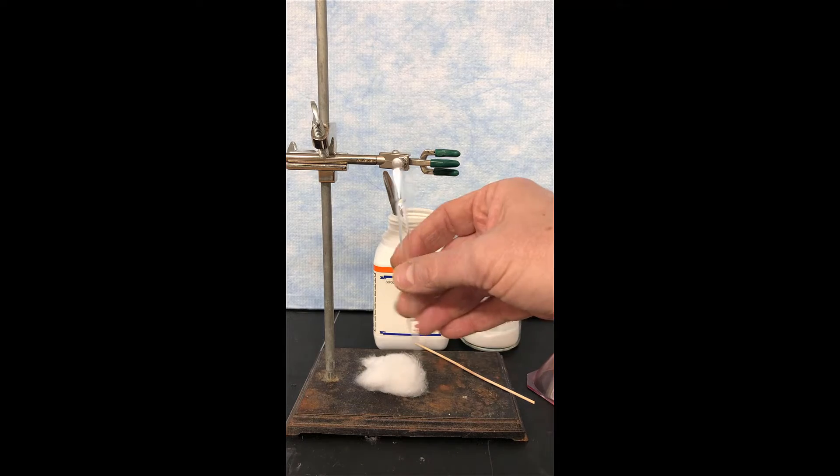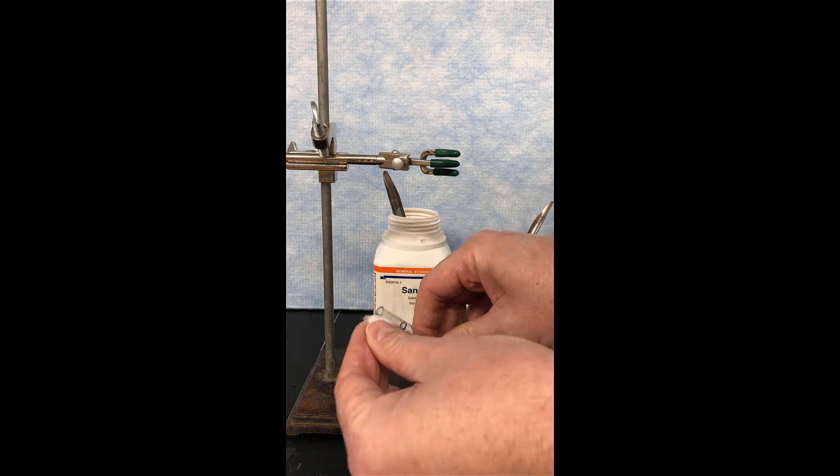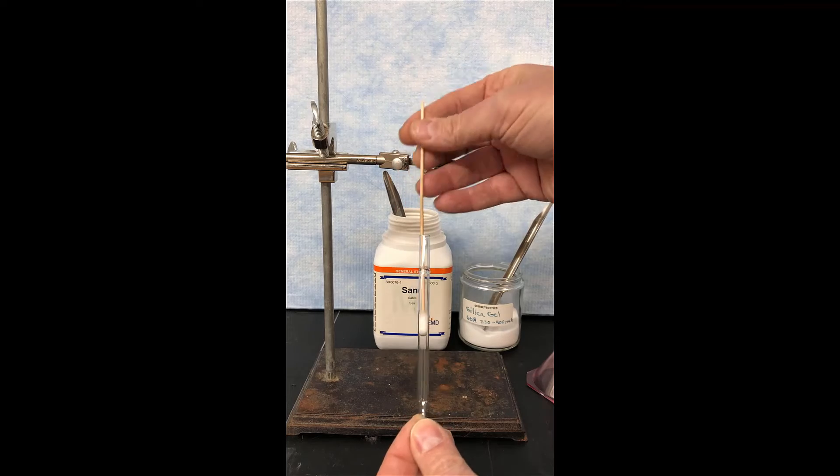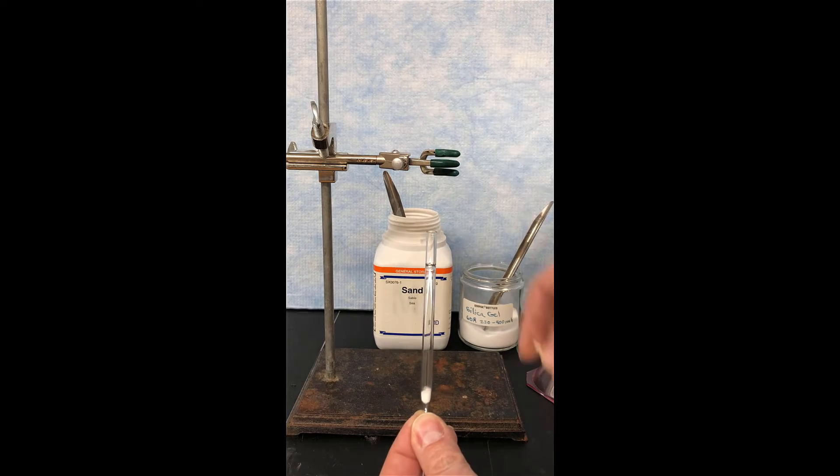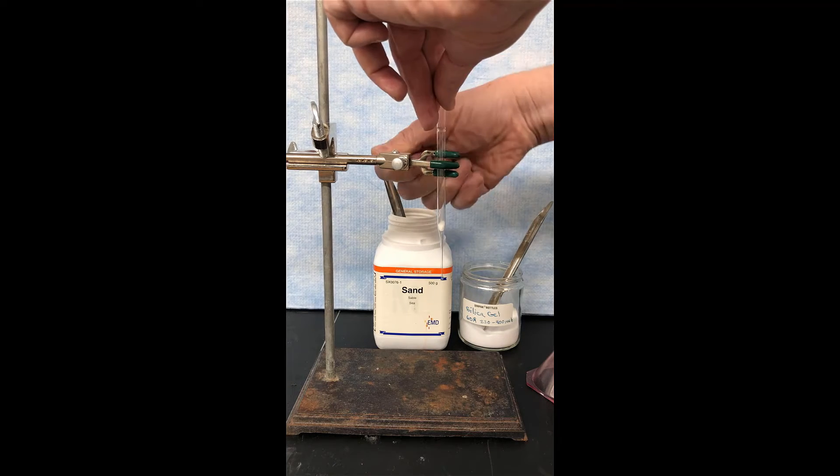In this portion of the experiment, we're going to use a glass pipette as a column. So we're going to rip off a little piece of cotton wool and shove it in this pipette, tamping it down with a stick until it gets down into the tip. Then we're going to clamp it. Next, we're going to put a funnel on top.